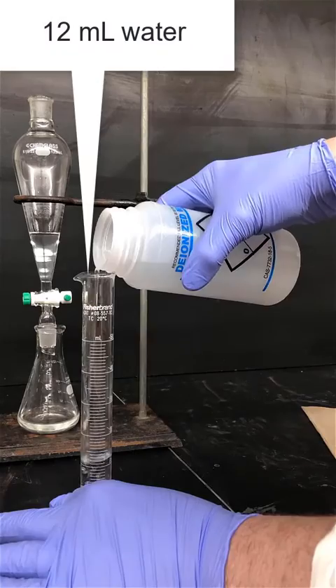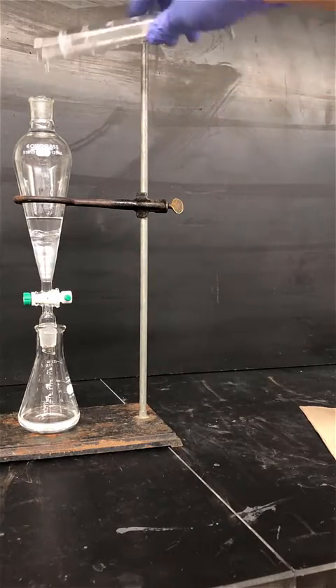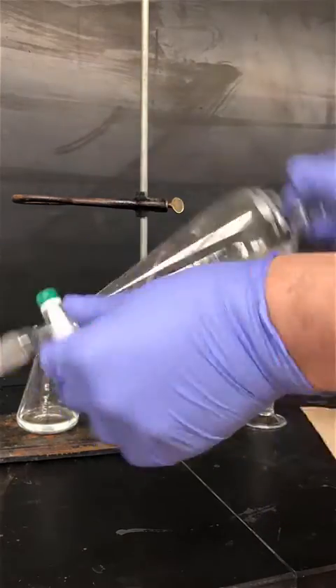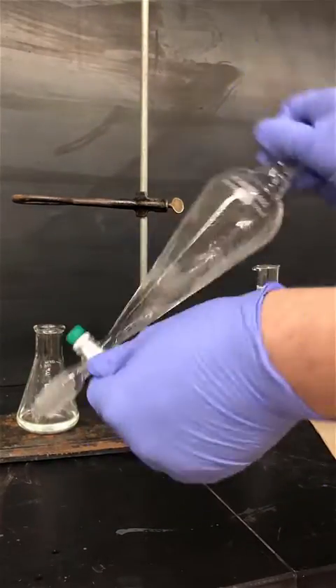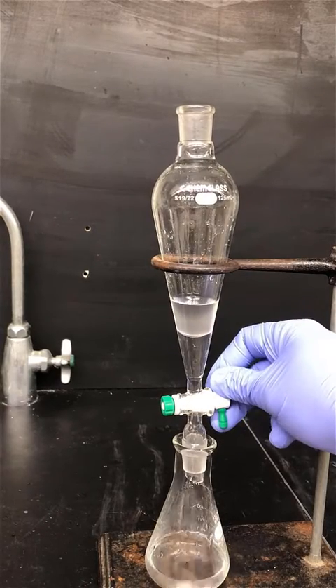Next, add 12 milliliters of water to the separatory funnel and shake it. This is going to wash the organic layer to try to remove some residual acid. Drain the lower aqueous layer out of the bottom of the separatory funnel.